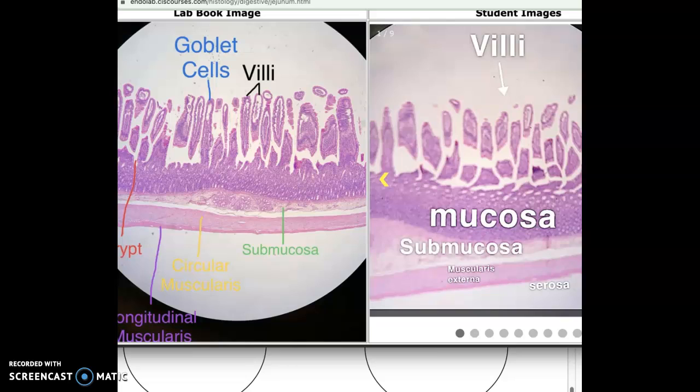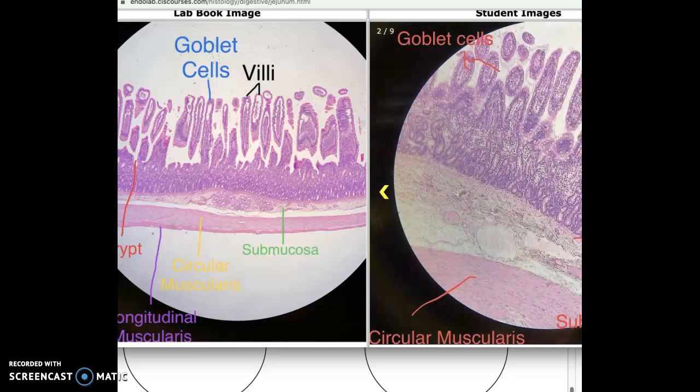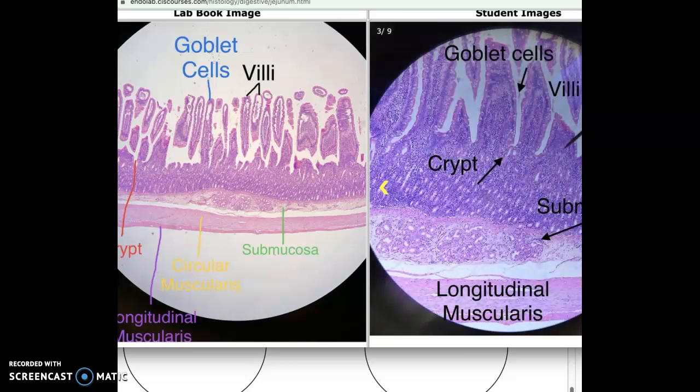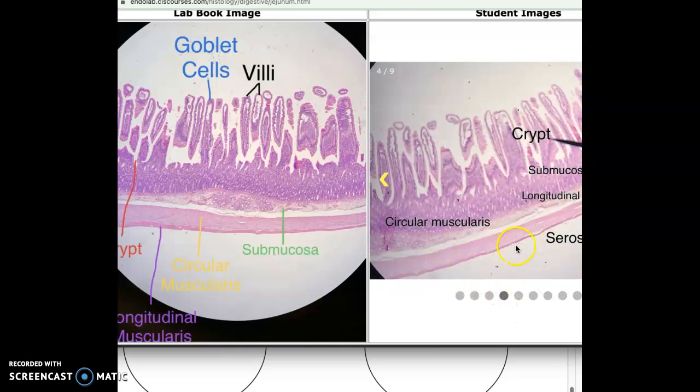So this is what you are drawing on the low power one. This is actually a nice one. And so the serosa layers here, they didn't really label it.